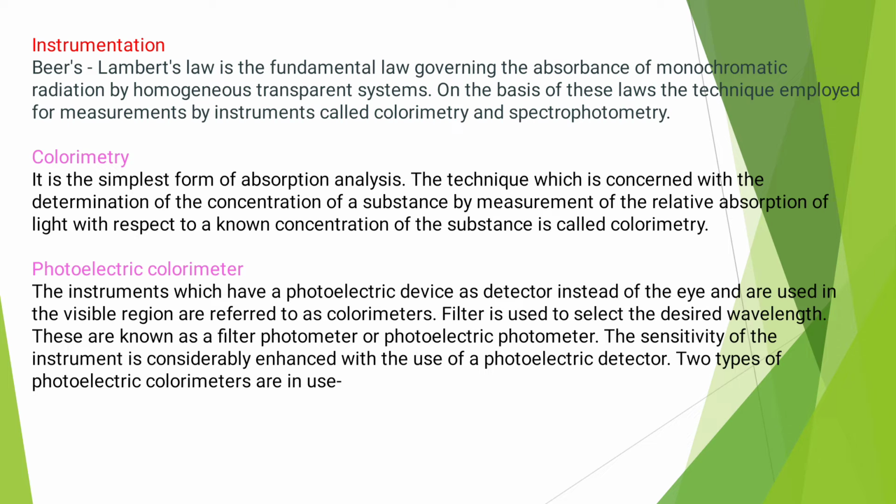When you measure the absorbance, you will get the transmittance, which is the inverse of the absorbance. So this instrumentation is based upon these principles, that is Lambert-Beer's law. Next, after that, what is colorimetry and the photoelectric colorimeter?